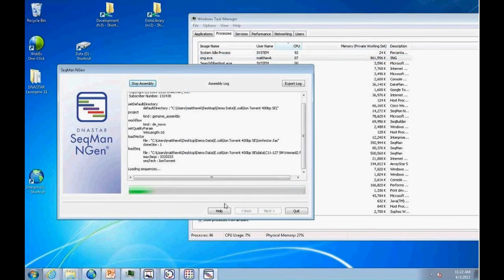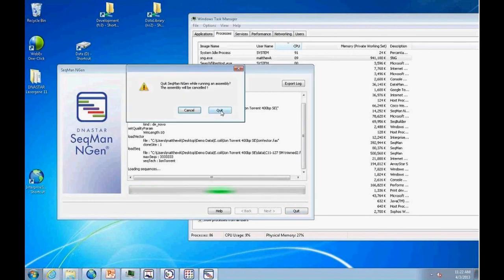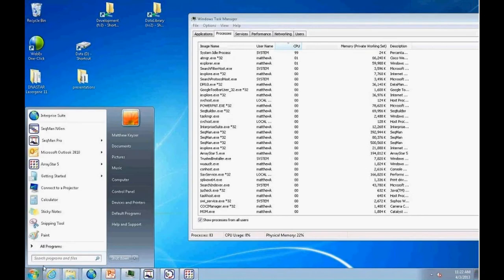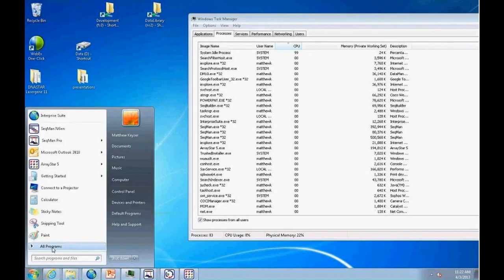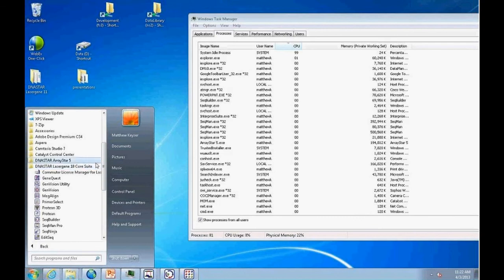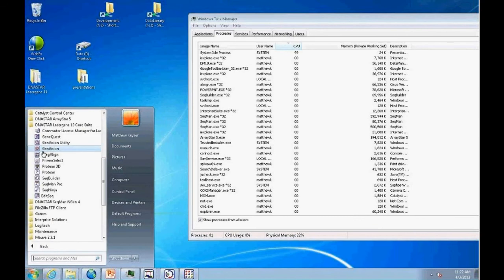When the assembly is done, there'll be a button to launch the project in SeekMan Pro. SeekMan Pro is one of the modules in the LaserGene Core Suite, which includes many modules offering different functionalities such as protein analysis, basic sequencing editing, and annotation. The idea is to run assemblies on a more powerful computer and do downstream analysis on laptops or regular desktop machines.